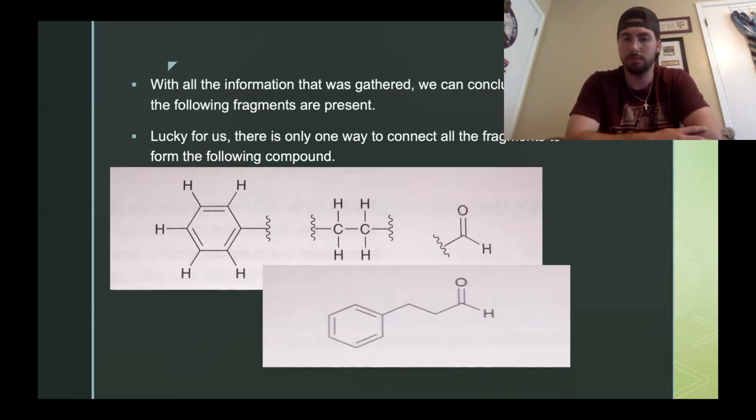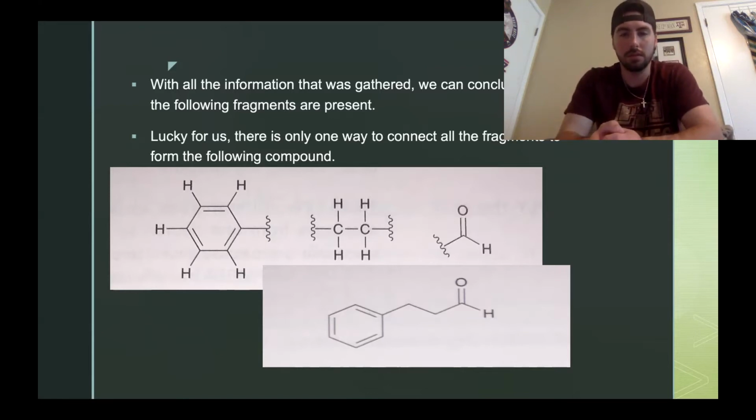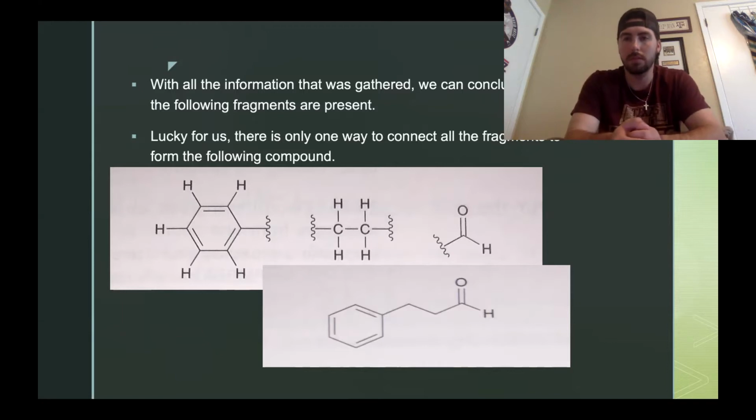And another thing, this was in, I think, Michaela's first structure, and what Hutch has now: if you look at the two CH2s next to each other, on the left there's no neighbor, and on the right there's no neighbor. So the splitting is just the CH2 getting split by the other CH2. So if you see those two CH2 peaks like that, can you go back to your spectrum, please?